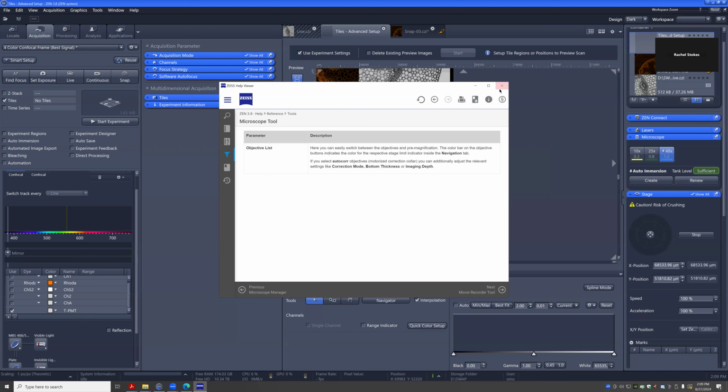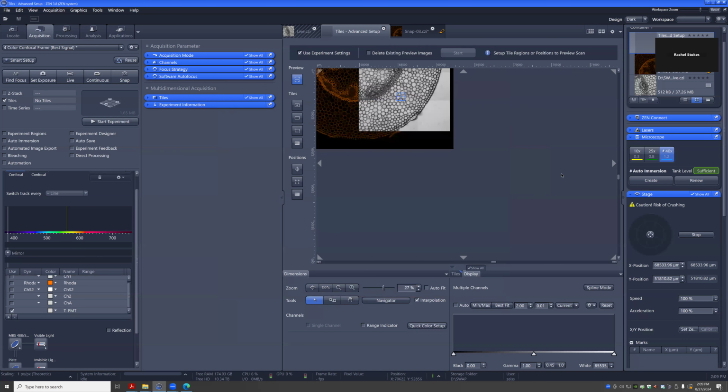Because I know how much I normally put on. So renewal will keep adding, right? And if you do a time lapse experiment, you want to check this box here. Oh, actually, it does do 500. For the renewal, it'll actually let you set the volume. It doesn't let you set it here. It lets you set it there.